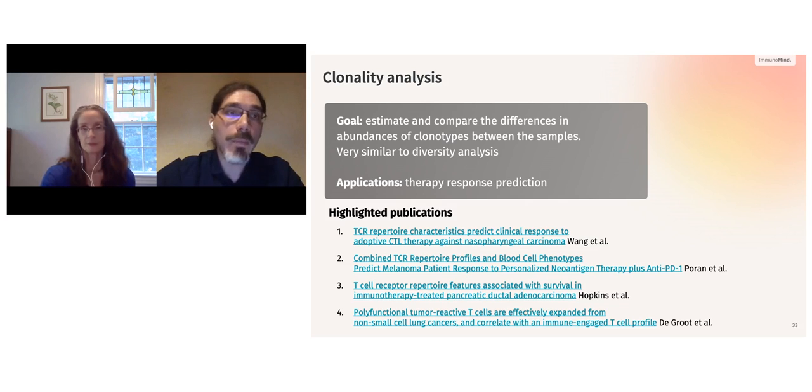However, maybe it's more interesting to use replicas for bootstrapping procedures. Again, I will not talk about this in these presentation slides because it's very advanced.